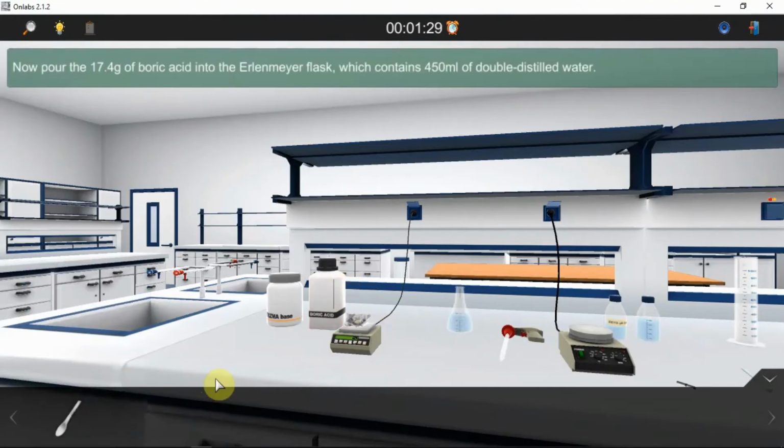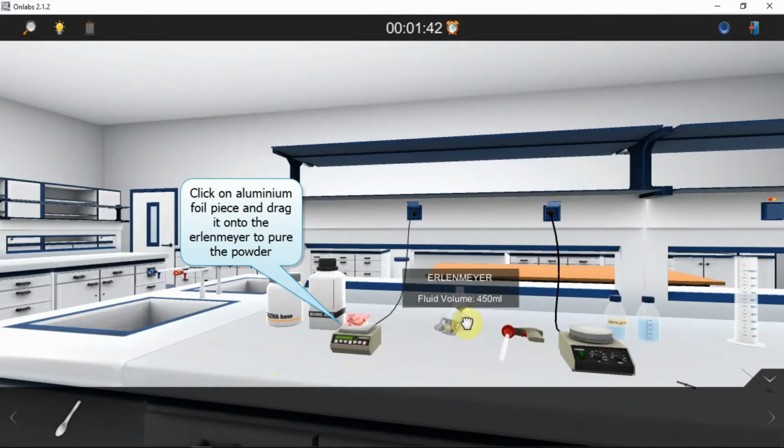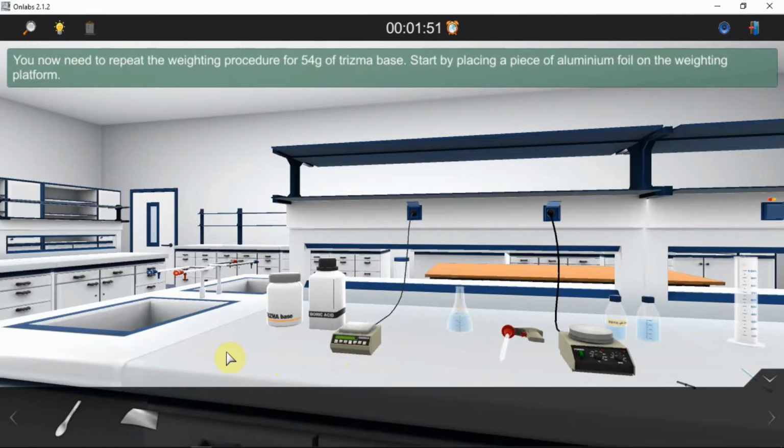Well done. Now pour the 17.4 grams of boric acid into the Erlenmeyer flask, which contains 450 ml of double distilled water. Well done. You've just added 17.4 grams of boric acid in 450 ml of double distilled water. You now need to repeat the weighing procedure for 54 grams of Trizma base.